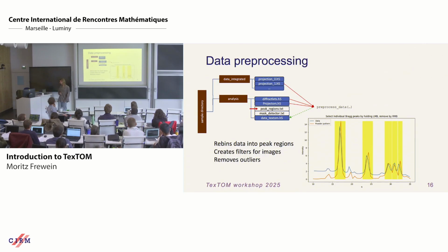Yes. So the next step, then, is the data processing. So basically you have to take out from the data sets the areas you want. We start with the pre-process data command, and then it will open this window.